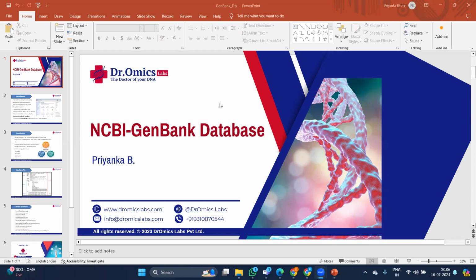Okay, so as we have discussed yesterday, we are going to start with the database, which is what? NCBI. So may I know how many of you know about the NCBI? Anybody have used this NCBI before?